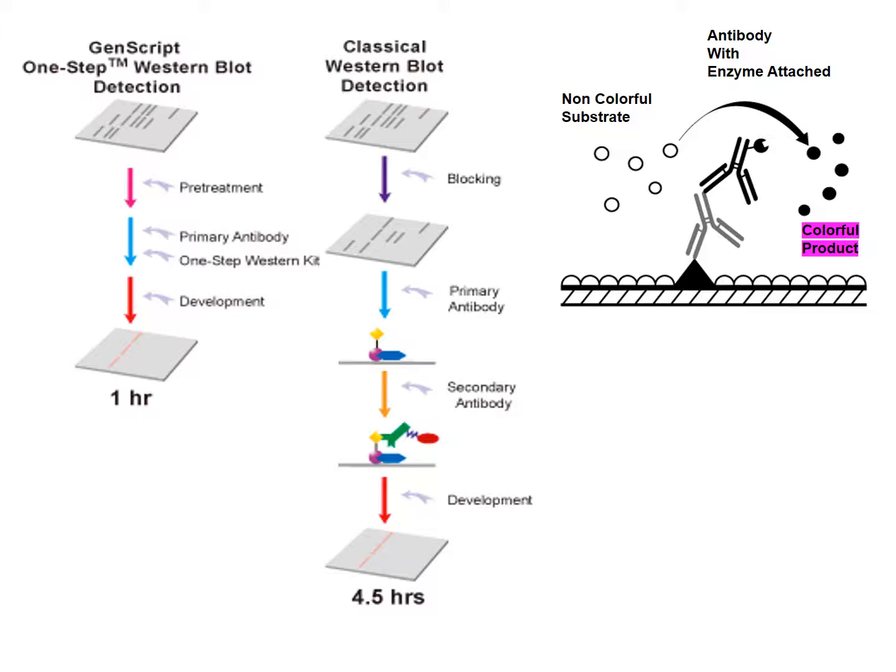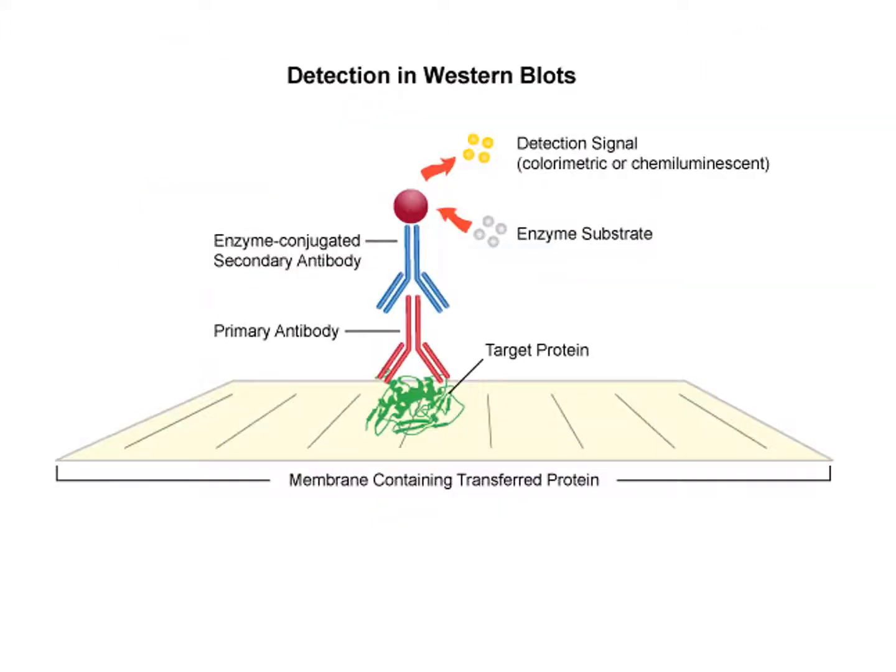And again, remember, the enzyme here is attached to the secondary antibody. We have some type of substrate, and we have some type of product made. So this is the product, and it usually has some type of color, and we get some type of band or spot that has a blue or black, some type of purple precipitant, and that is said to be the protein there.